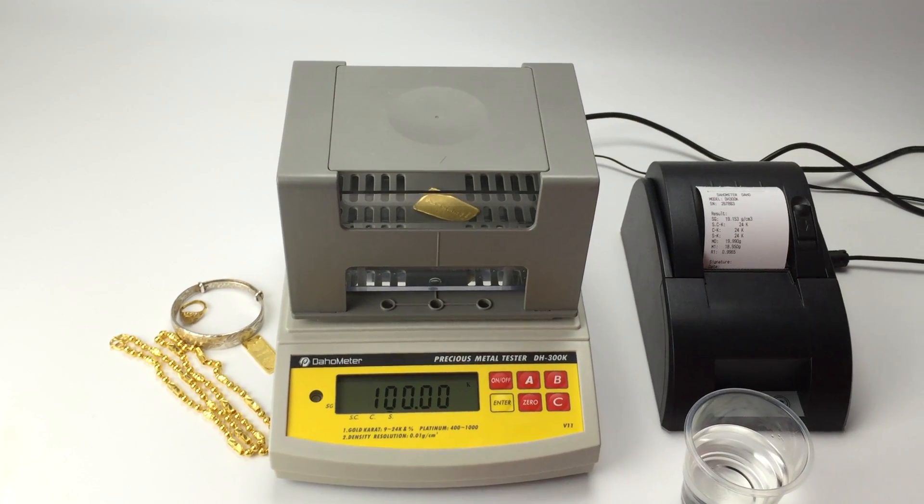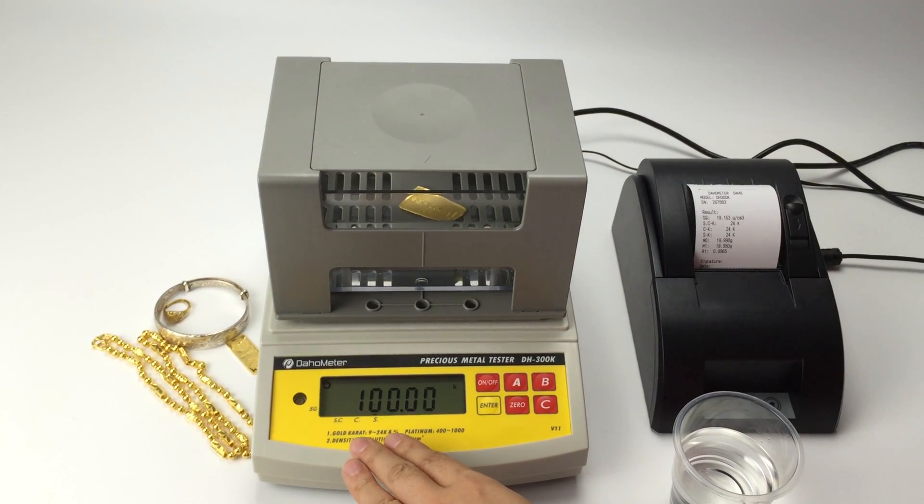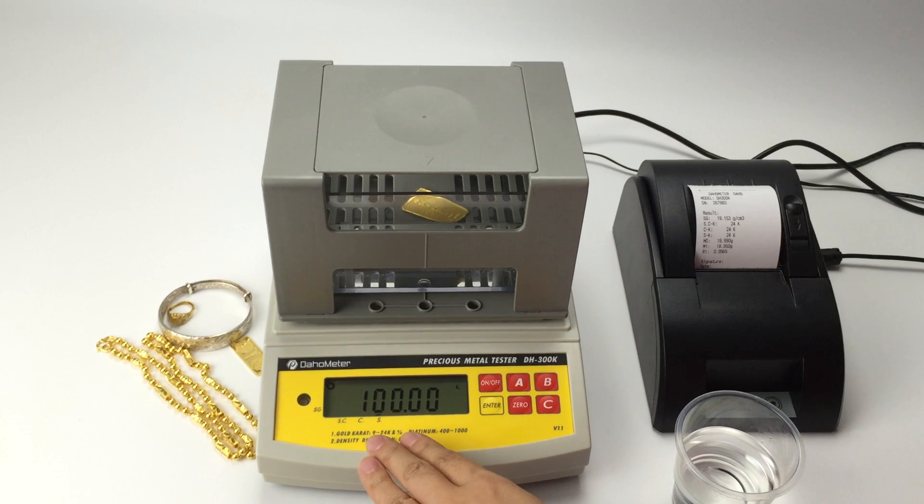Press A again. The purity percentage is for gold, silver.